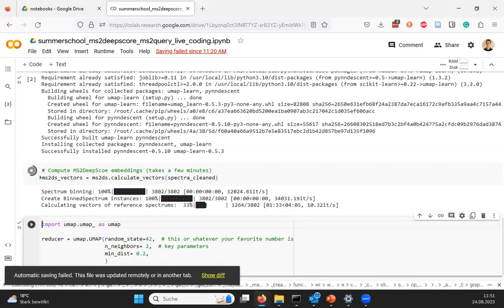Yes and no. Usually, if you want to use tools like PCA or t-SNE or UMAP, you need to consider pre-processing. These tools assume that you have vectors with numbers of equal range. Otherwise, they won't work nicely. They will not fail, but they will give you weird results. But here, when we get these vectors, they are already good to go. Once we get these vectors, we can immediately put them into PCA or t-SNE or UMAP. We don't have to worry about the data processing anymore.